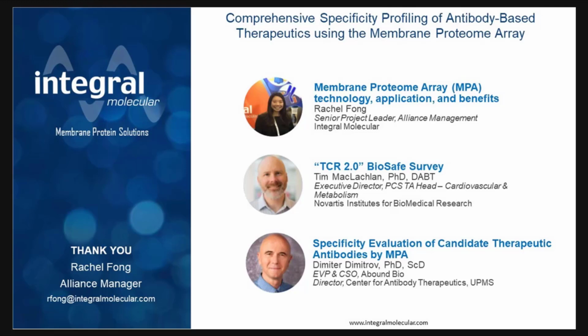So we can use also TCR later if we have some problems with the membrane proteome array. So this is why we started with that, and also because we can have multiple antibodies in general, because our company is really a company where we try to save money. Excellent reason.